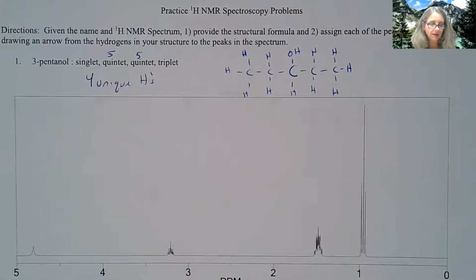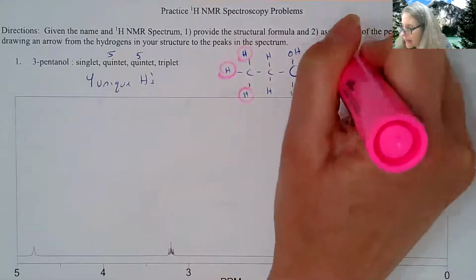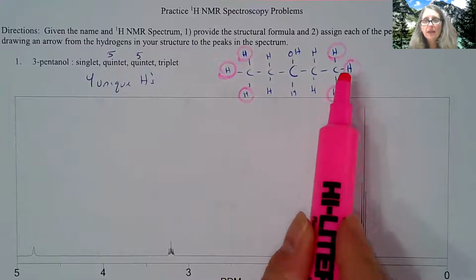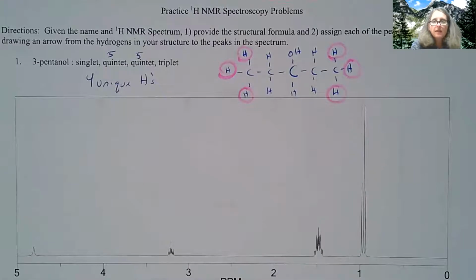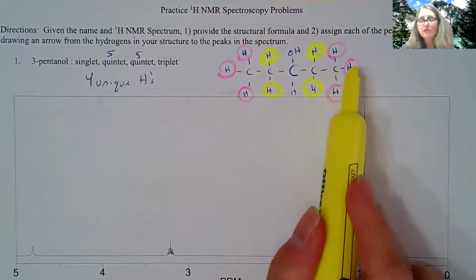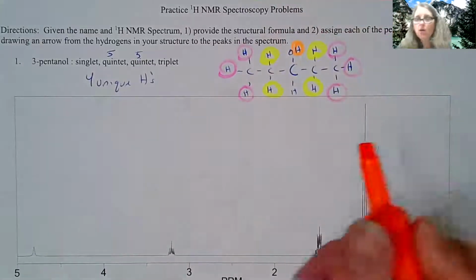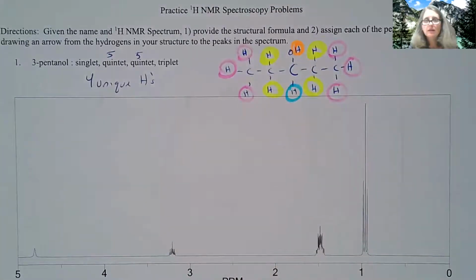So whenever you see a molecule like this, you want to look at each one of the hydrogens maybe as the same thing, because if you look at the ones I just circled in pink, they have a next door neighbor that has 2 hydrogens on it. So they are somewhat similar. And if I look at their next door neighbor here, these hydrogens are right next to a carbon with an OH, and then they have CH3 next to them, so those are probably unique hydrogens. Then I got this hydrogen, of course, on the alcohol. That's unique.